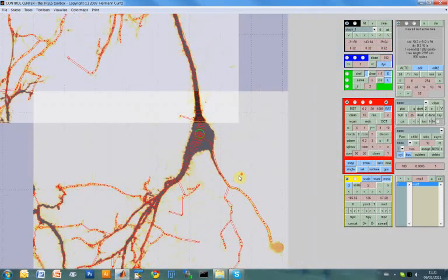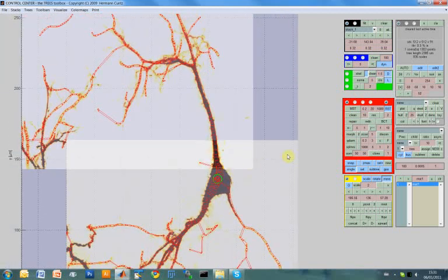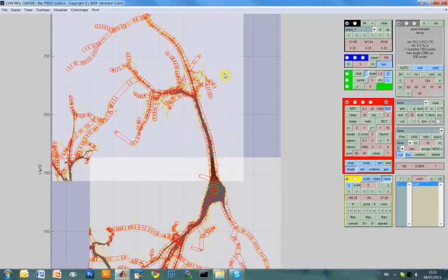So also for the diameter, there are some automated global functions. For example, we can map quadratic diameter decay. The quadratic diameter taper has 2 parameters, one which is a slope and one is the offset, let's say. You can just press on this button to see what it does. Okay, so the 2 parameters were obviously a little bit too large, so the second one here is basically the diameter of the termination points.